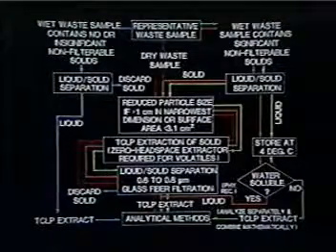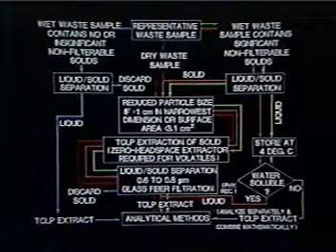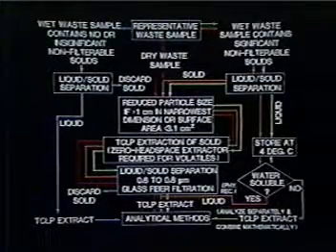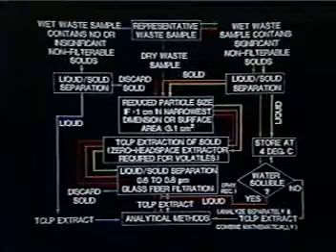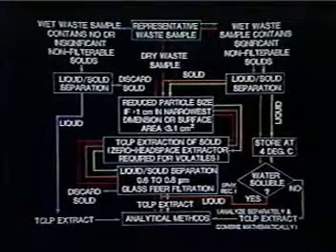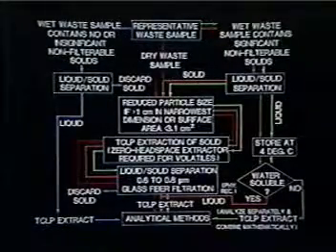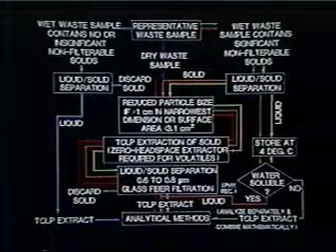The TCLP includes a step for preliminary determination of how the specific waste should be handled. The TCLP flowchart, which you now see on the screen, shows how several different paths may be taken in performing the procedure depending on these determinations. To demonstrate this fully, we will run different types of waste through the TCLP. As we do this, we will refer again to the flowchart to show which path is being followed.